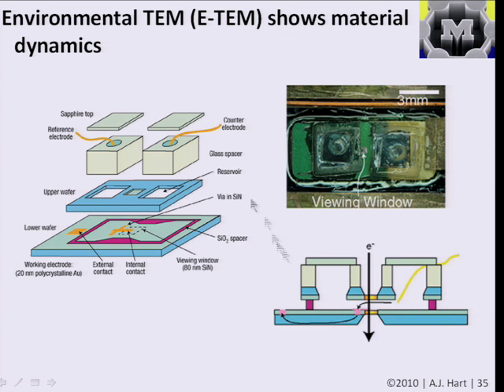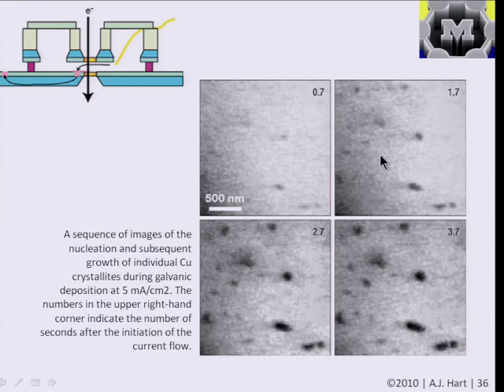And this was from a few years ago, and there are more sophisticated, or you could say neater-looking, designs since then. But by connecting a couple of silicon wafers with thin windows in them and a couple of electrodes, by a combination of manual assembly and microfabrication, they created this little cell which they put on their sample holder in the TEM and ended up passing the beam straight through this window. And we're able to see.